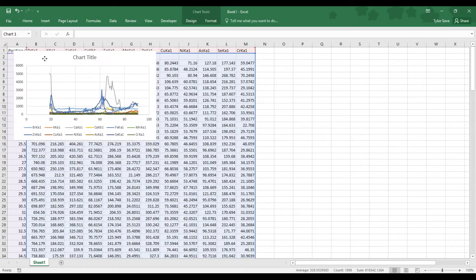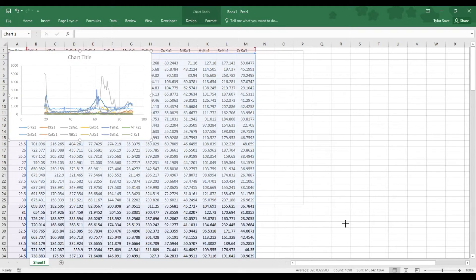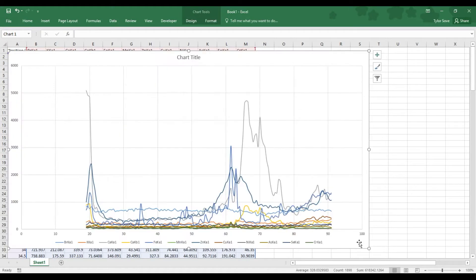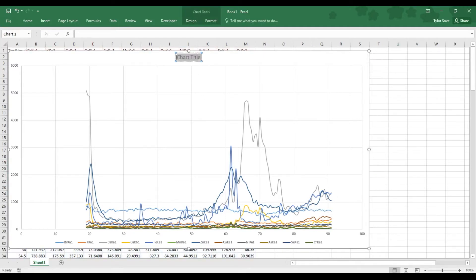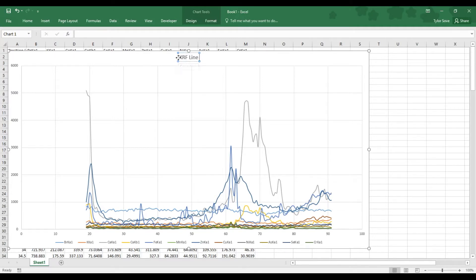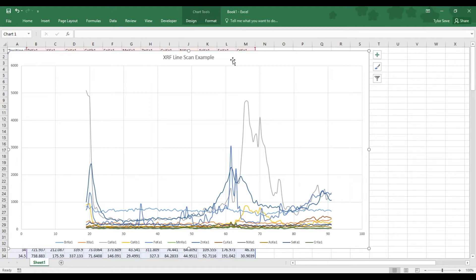Now, this is just a bit small, so it will make it a bit bigger for us. Now, this graph looks okay, but a few things need to change. First and foremost, it needs a title. So, we will label that. There we go, XRF Line Scan Example. Your chart title will be something a little better than mine. Probably XRF Line Scan and then your sample name.